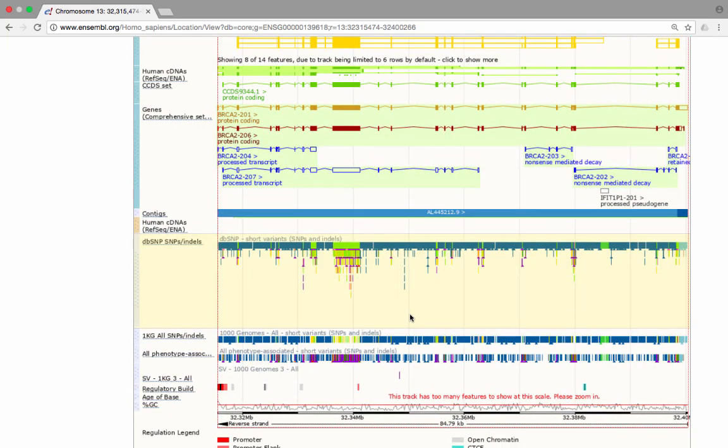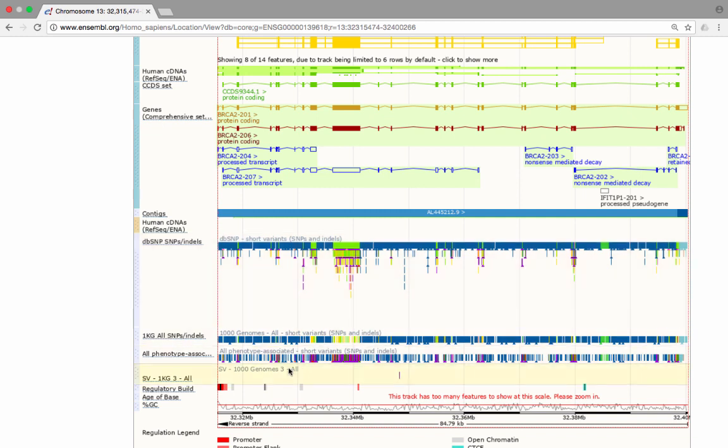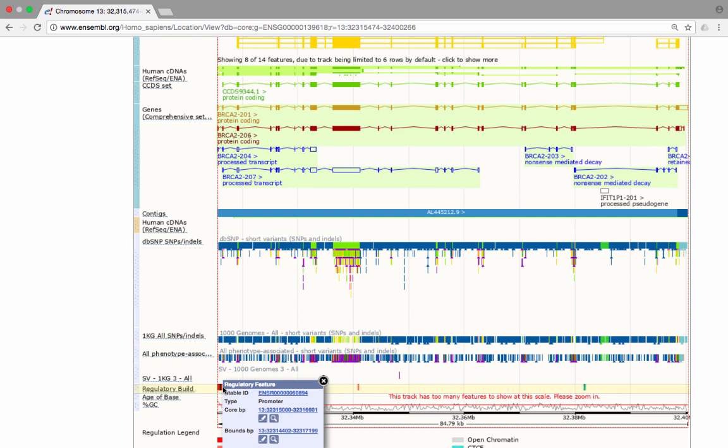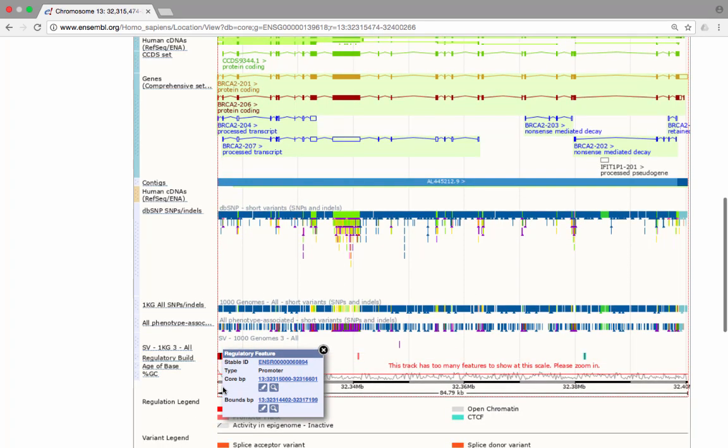Finally, you can also find out more information about regulatory features present in this region of the genome by clicking on the individual features in the regulatory build track. The pop-up window will contain information about the type of regulatory feature it is, plus a link to the regulatory tab, a page that contains all the available information for this regulatory feature.